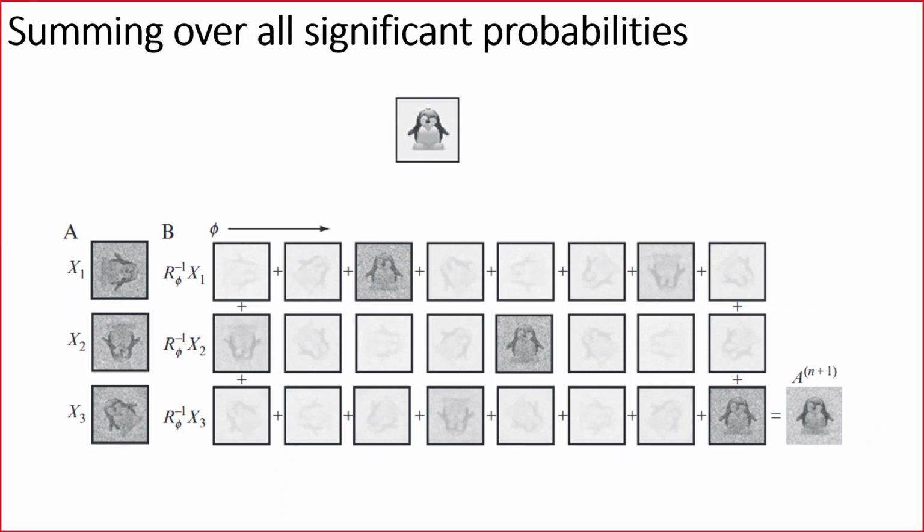So using this, we can take, for example, our measured data and compare our measured data rotation against our reference. Here we have a reference of the standing penguin, and these images are representing how probable is that single rotation of the penguin with the reference. If it's very dark, it's very highly probable. If it's very faint, it's not too probable that that's the correct orientation.